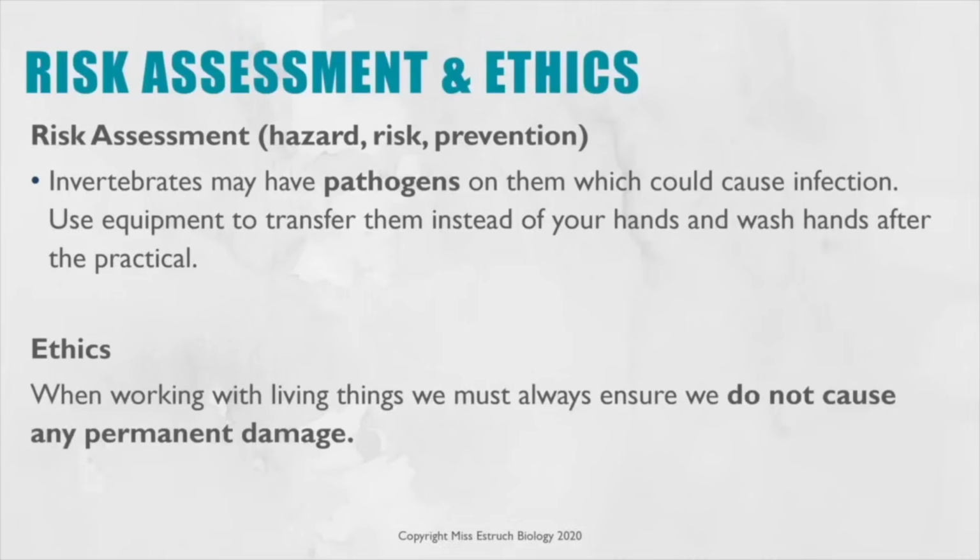Ethics. Now, whenever you are working with live animals, you have to make sure you are not causing any permanent damage. That is your aim in terms of working ethically with a live animal. And that's another reason we're using the teaspoon, because when you pick them up, you might cause some damage and you can potentially be more careful with a teaspoon.